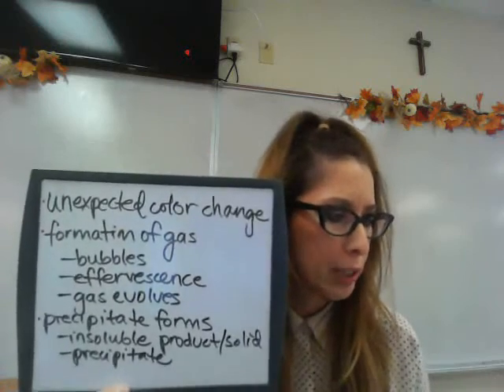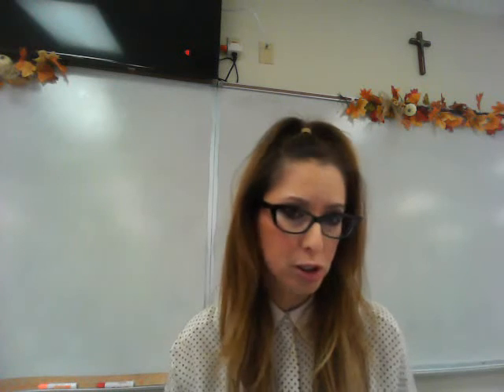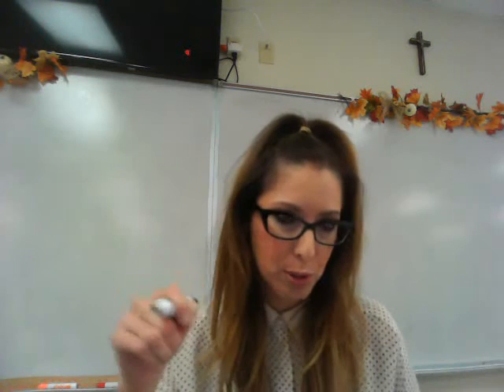Okay, so then as you move on to part C2, you're going to be testing silver nitrate with a salt solution, silver nitrate with a sugar solution, tap water, and deionized water. So what you're going to be doing is making solutions of salt and sugar, and I explain exactly how to do that in the procedure section, so make sure you read it very carefully. You may want to get a highlighter and highlight the important parts. You're going to be taking a glass stir rod and you stick it into a test tube and you mix things up to dissolve them.